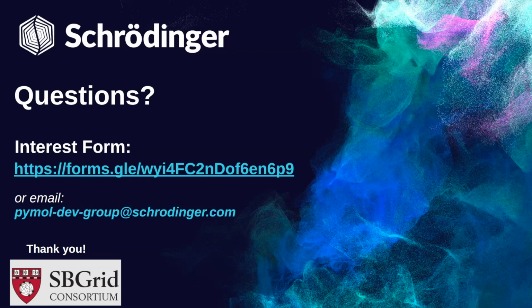So we're looking into using sculpting along with this rotamer fitting tool to see if we can do something like, I don't know if people use ISOLDE, where you can take a rotamer and try to manually fit it into density in real time. So we're exploring that option as well, since we already have the sculpting backend to help us with that. Very cool stuff.